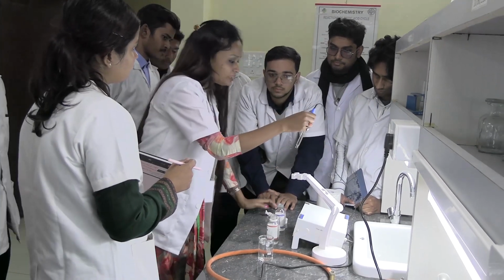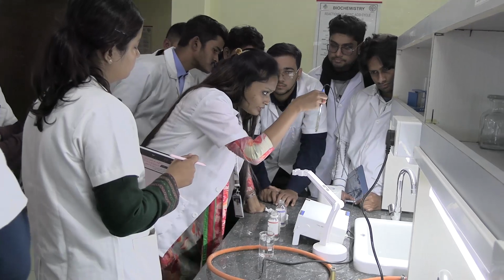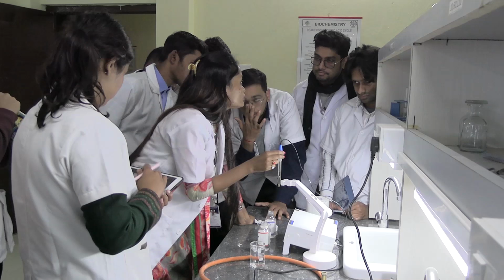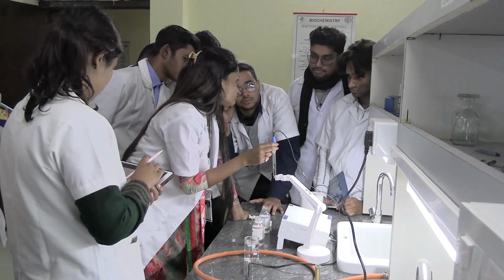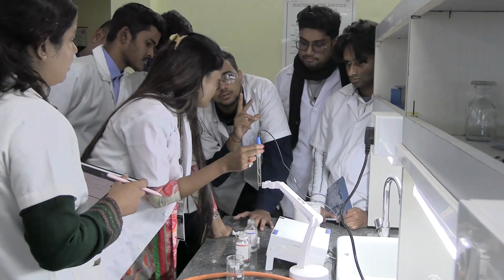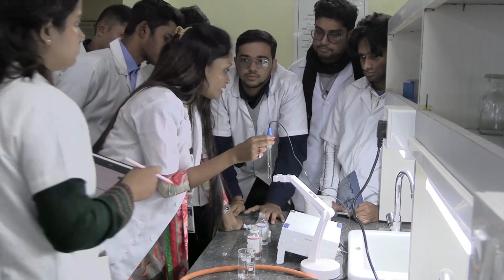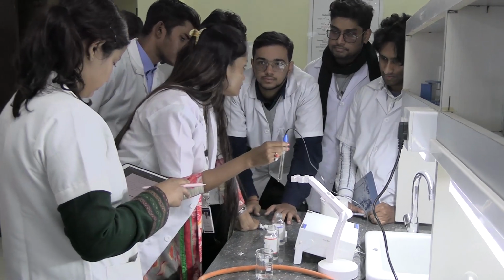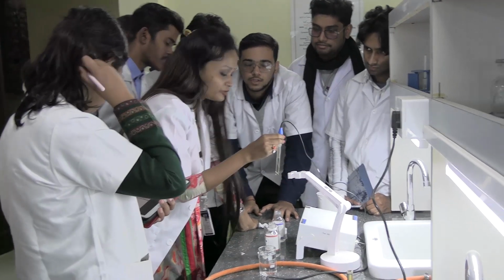In the principle of the pH meter, we have shown there are two electrodes: one is the measuring electrode and one is the reference electrode. The measuring electrode is the glass electrode, and the reference electrode is the calomel electrode.